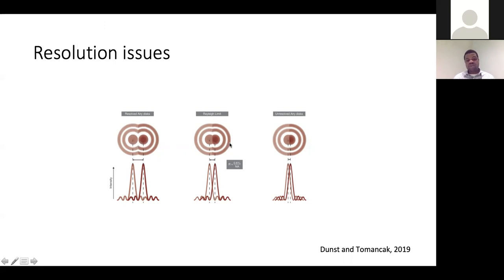As they get closer and closer, it becomes more and more difficult to resolve them. And that is what, in many cases, you have to think about when people are asking about resolution: the idea is to be able to separate your two different signals and distinguish between them very well. Okay.